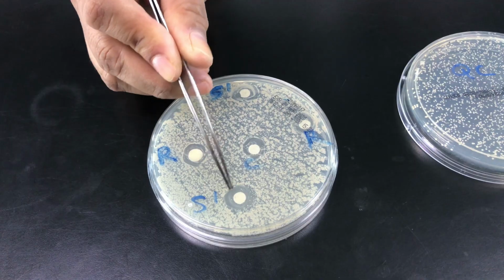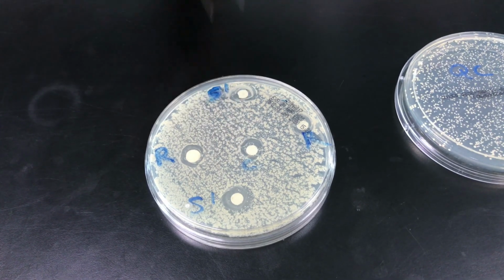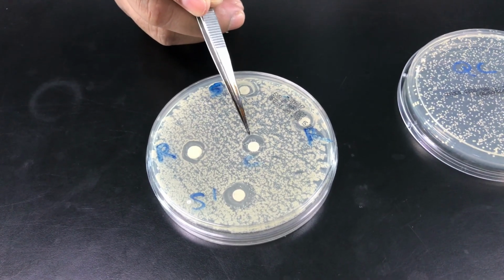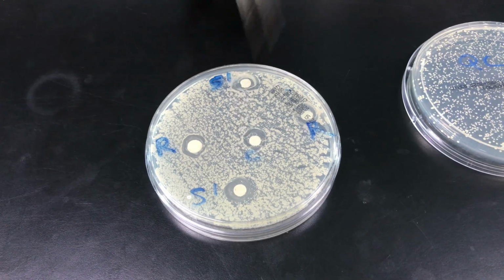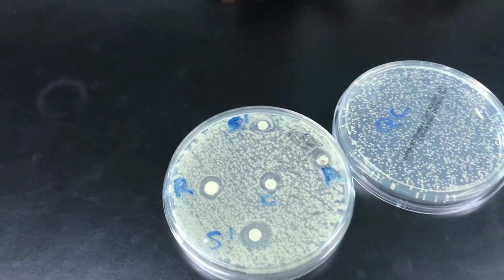Okay, so from all these zones, we will measure the diameter of each zone, and we will plot the standard curve, and we will also determine the concentration of C, which is this one. We do not know the concentration. This is produced in-house. So we will determine the concentration of culture Nisin using the standard curve that we produce. So that's all for today's experiment.